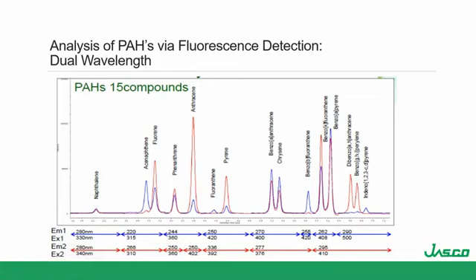If you're working with a UV-Vis detector and you have some sort of ring structure or some type of chromophore, you can get a lot of those compounds with two wavelengths, 254 or 220. That is not the case with fluorescence detection. It's much more specific, but as long as you have the ability to switch excitation and emission wavelengths really quickly, and you can monitor a couple conditions, you should be able to get everything that you need.